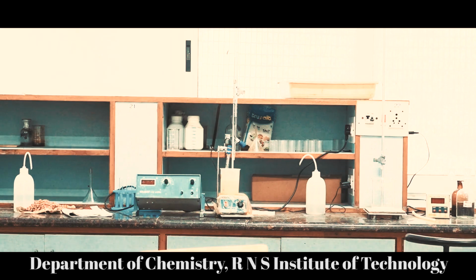Now in the calculation we take the unknown volume of the test solution from the graph. We've got 3.8 ml. 3.8 ml into 1.018, which is 3.8684. This is the volume of the electroplating effluent, 3.8 ml, and the weight of copper present in the test solution of the electroplating effluent is 3.8684 milligrams. Thank you for listening.